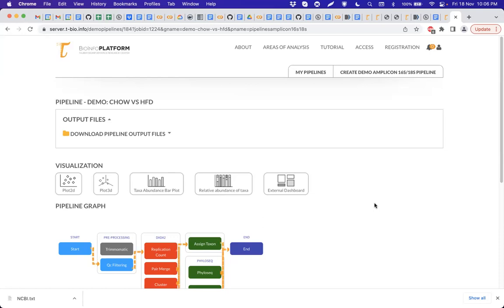This probability method estimates not only the sequence identity but, based on it, the probability of two reads being closely related. Based on this probability, you will find some reads that do not fit anywhere, and these are eliminated completely in QIIME.